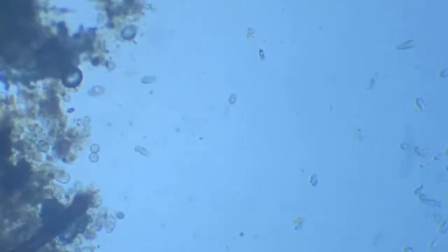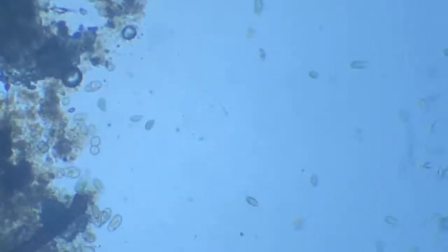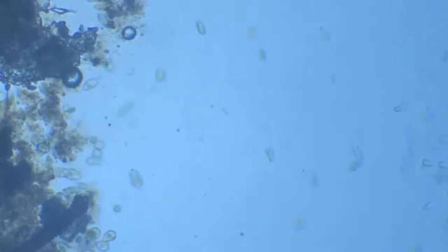All right, so there are a few, you can make out, yes. All right, so now that we are through with this part, let's focus on some other place.